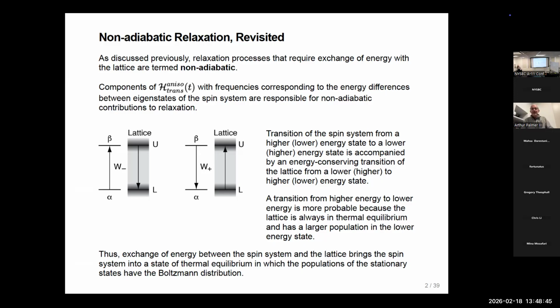I mean, that also tells you something about NMR, because we talk about the radio frequency pulse, but we don't really have electromagnetic radiation in the way you think of it. Electromagnetic radiation that's coming out of the lights here, the B field and the E field are equal to each other. They're just oscillating out of phase and orthogonal.